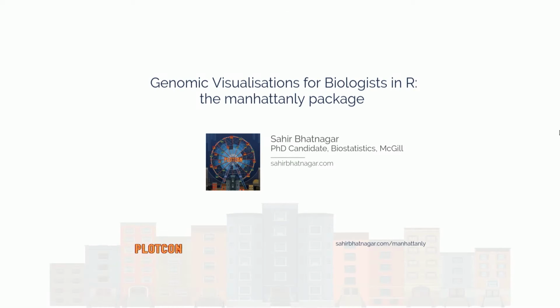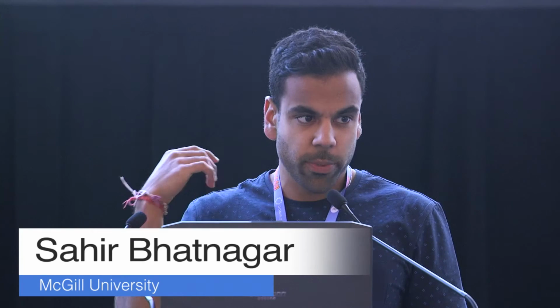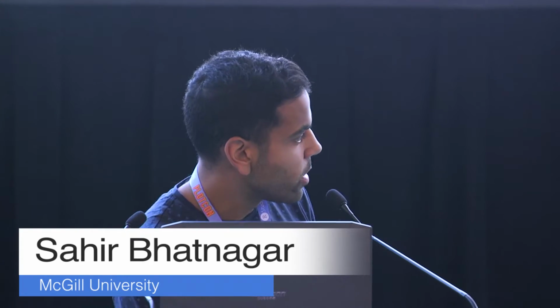So I'll be talking about genomic visualizations for biologists in R, and this is based on a package I wrote in R called Manhattanly. A lot of the details you'll be able to find in a vignette that I have on my website there. And I'll just talk about the motivation and some of the functionalities of the package.